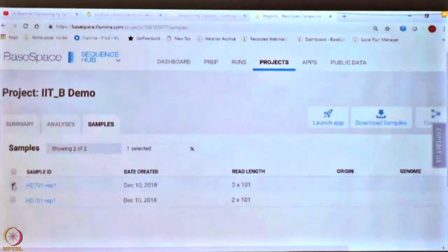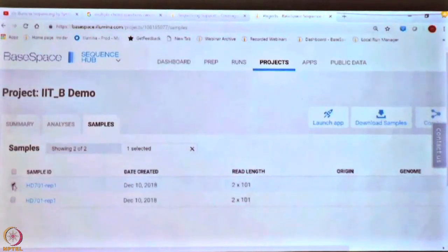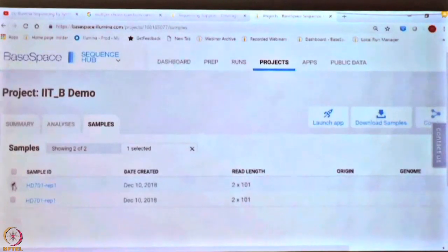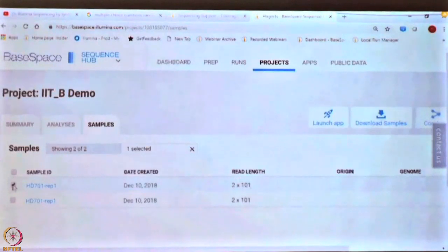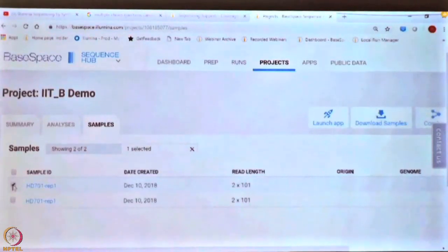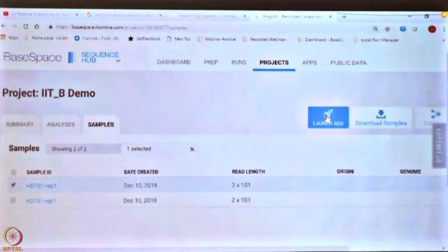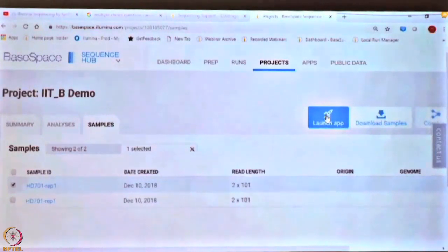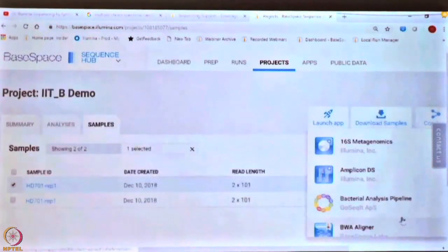What I wanted to show you now is launching an analysis. Once you have your data in BaseSpace, how do you launch an analysis? There are multiple apps or applications available on BaseSpace. This particular data was generated for a panel known as TruSight Cancer, available from Illumina, which is used to detect germline mutations. Select the sample that you want to run the analysis for and click on 'Launch App'. When you click on launch app, multiple options are available depending on the analysis you want to do.